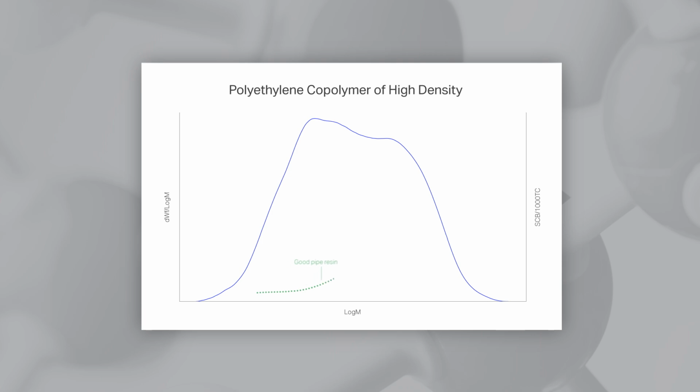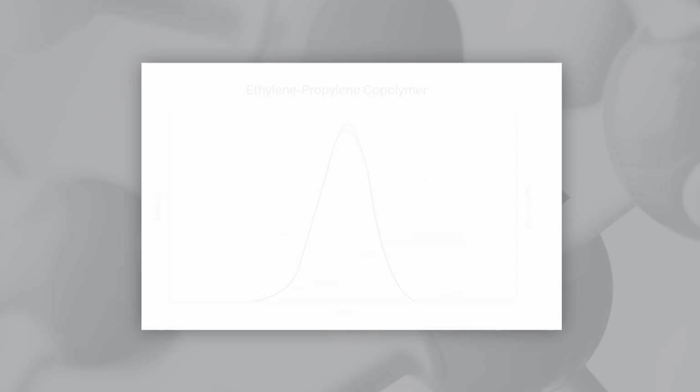this product's applications. However, there can be polyethylene resins with similar broad distributions also produced in two reactors, but with completely different performances. In this case, the short chain branching is incorporated in an opposite manner, decreasing the number of branches as molar mass increases.